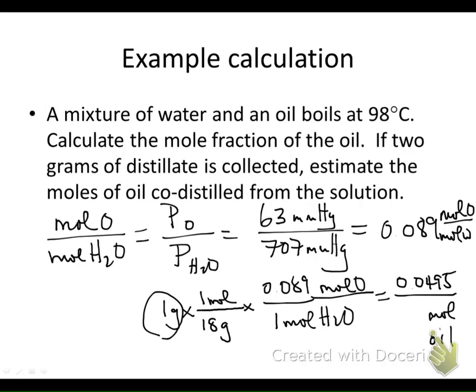But for most practical purposes, when you do steam distillation, this is a good approximation, because the oil is really not that soluble in the water, so the distillate ends up being mostly water. The other reason that this is a reasonably good estimate is because it makes the assumption that the oil is not actually soluble in the water at all.